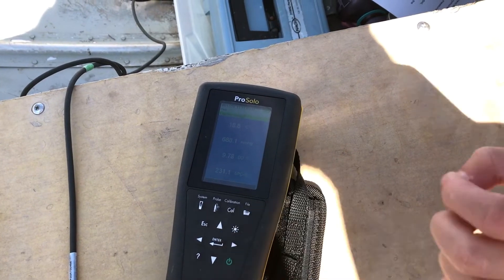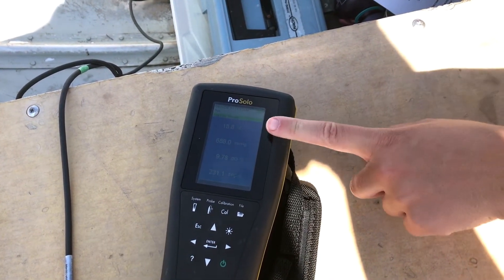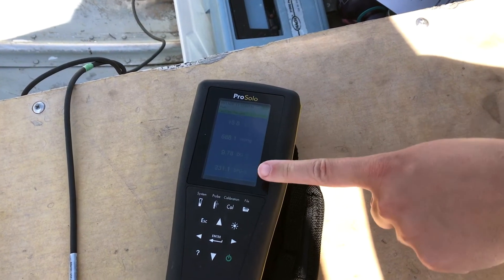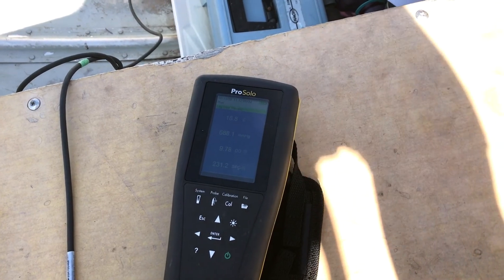So as per our Pro Solo screen, the temperature on our southern site is reading at 18.8 degrees, dissolved oxygen is reading at 9.78, and specific conductivity is reading at 231.2. Let's pull it in.